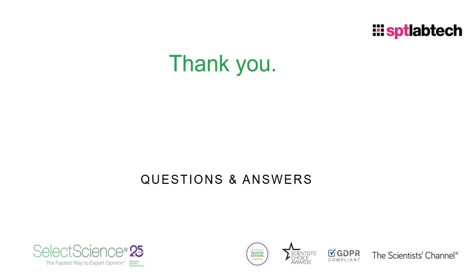Yeah, thank you, Lawrence. I think it does depend on the business, but one good starting point is having an automation-ready tube and moving towards an automated workflow. Getting the labware in line for automation is a crucial key point.